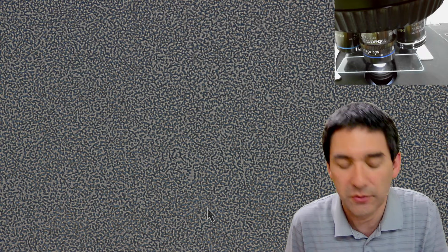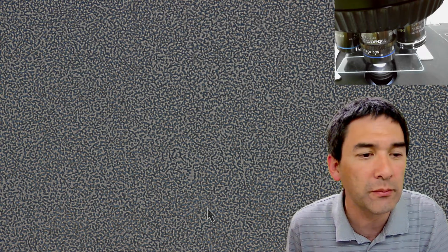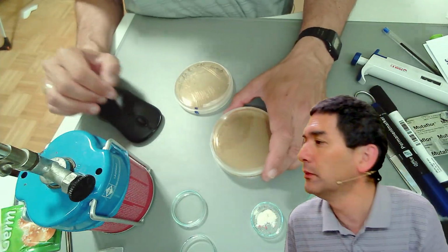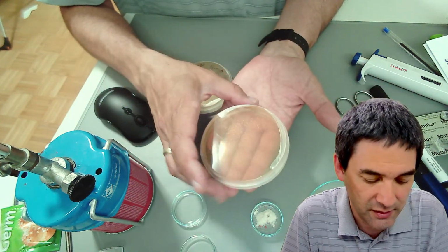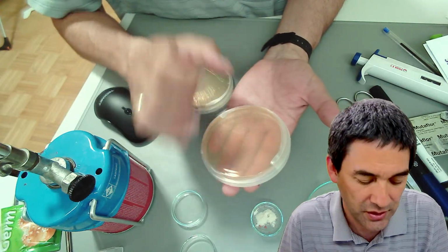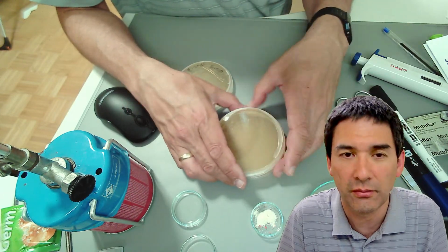Plastic, glass? I'm using the plastic ones, disposable plastic Petri dishes. I'm just going to switch over again to, How big are they? I don't know. I don't even have a ruler here. That's basically the standard size. Yeah. Are they 9 centimeters across? Yeah. I would say probably. Yeah. So these are the standard size Petri dishes.